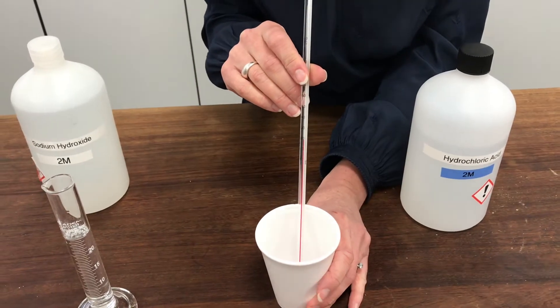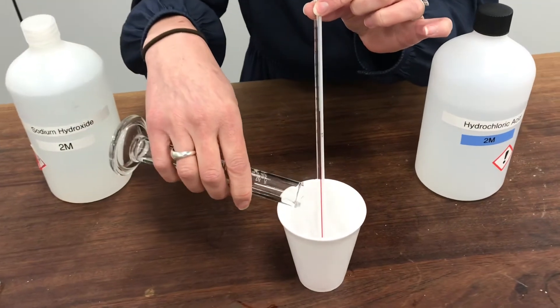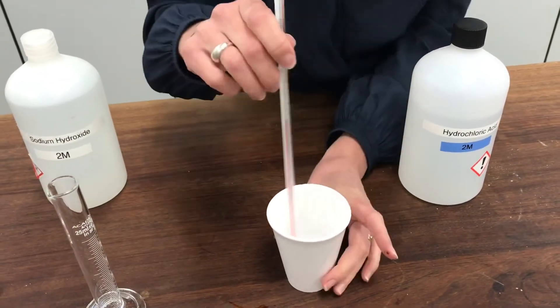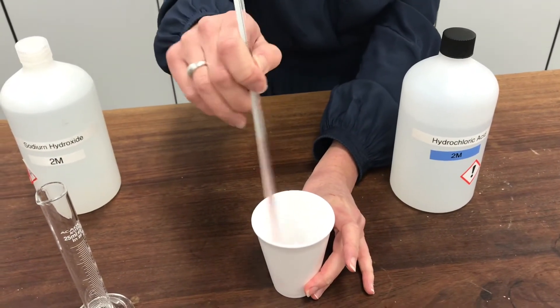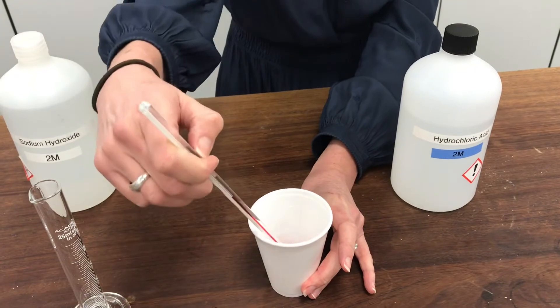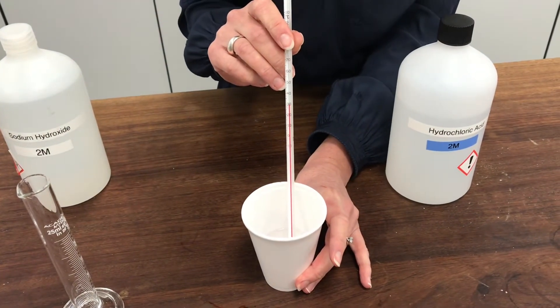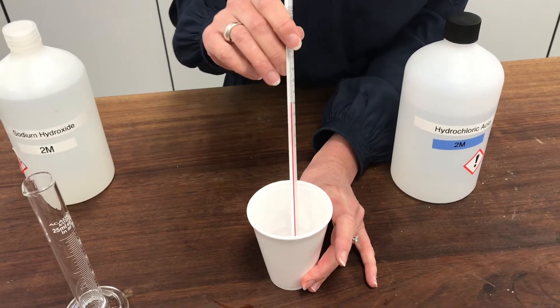Okay, so I'm now going to add my alkali to it and watch what happens to the temperature. Stirring as usual to make sure the heat's distributed evenly through the liquid. And you can see there has been quite a temperature change already. Let's see if we can see what the maximum temperature change is.